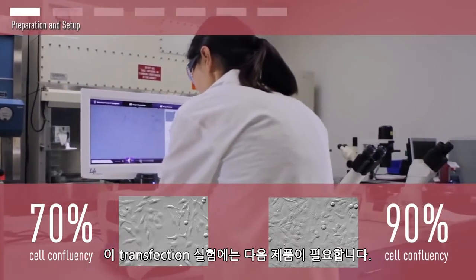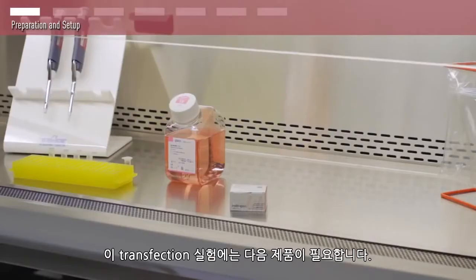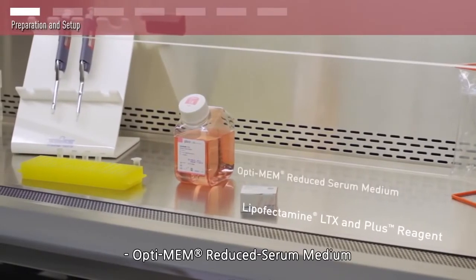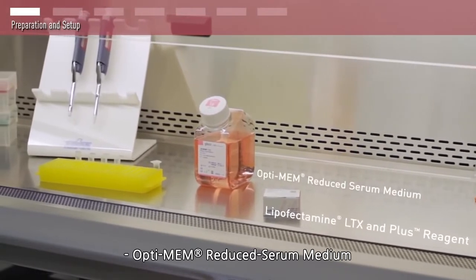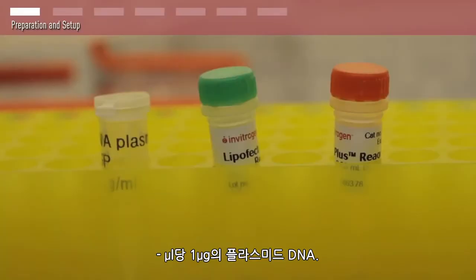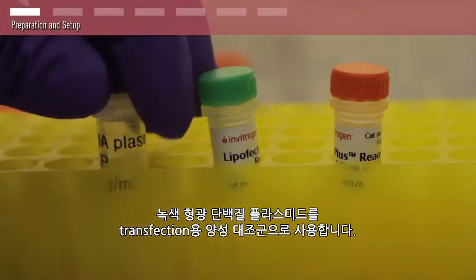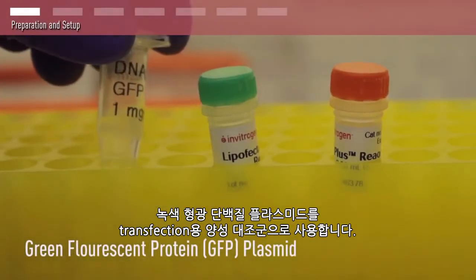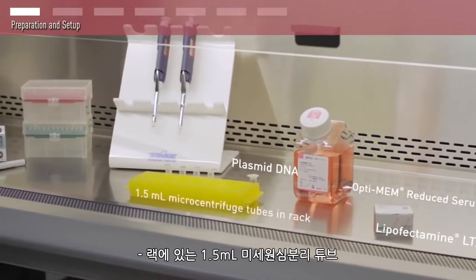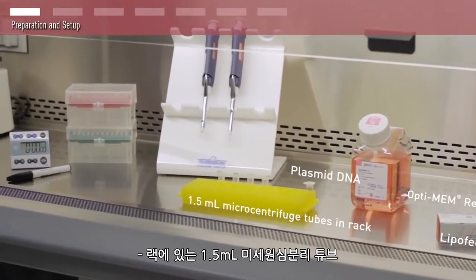For this transfection experiment, you will need Lipofectamine LTX and Plus reagent, Optimem Reduced Serum Medium, and plasmid DNA at 1 microgram per microliter. We will be using a green fluorescent protein plasmid to serve as a positive control for transfection.